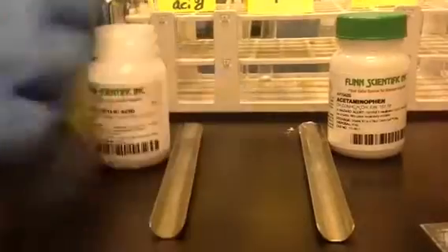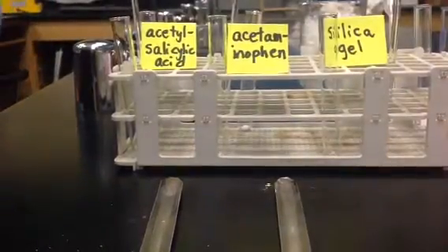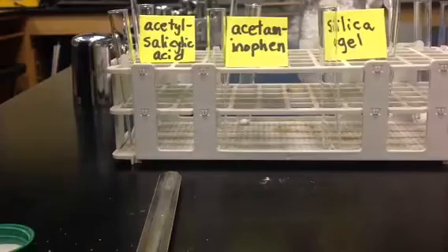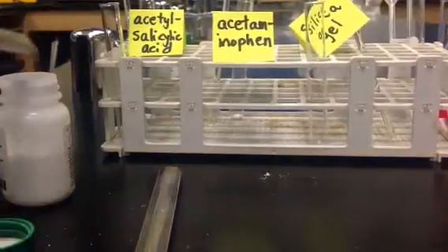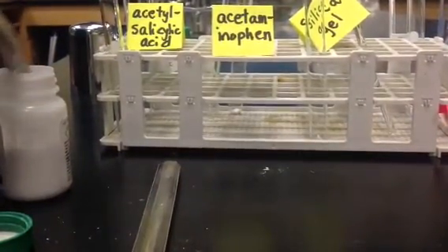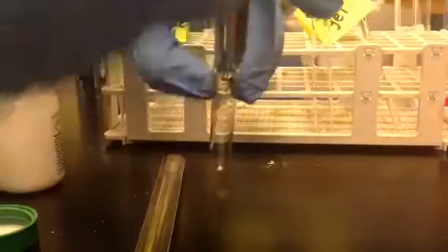And this is the acetylsalicylic acid. Putting the top on the reagent bottle. Acetaminophen, you also want just a pea size, but even less than that. That's more than enough. It's probably a little too much. So I'm going to use about that much.